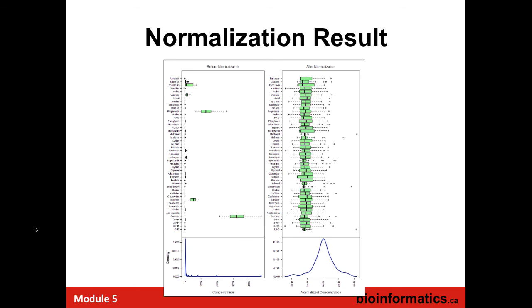When you normalize the data, you could normalize across the samples for the feature, or across the features. No, you should go across the features. Features normalize, not samples, because you think about your sample containing all different metabolites. Some metabolites are really abundant, like a sugar, like an acetate.